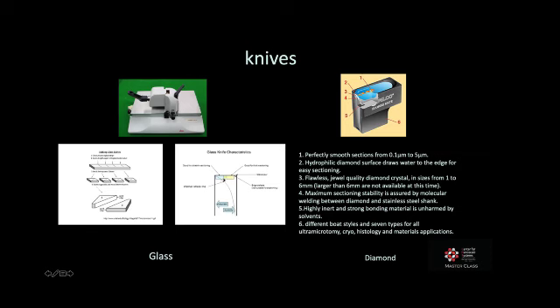So once we've got ourselves capable of cutting ultra-thin sections with a glass knife, we can move on to using a diamond knife. A diamond knife is in many ways easier to use because it's a perfectly smooth surface. It's manufactured to have a hydrophilic diamond surface to draw water up to its edge. It's jewel quality diamond crystals.